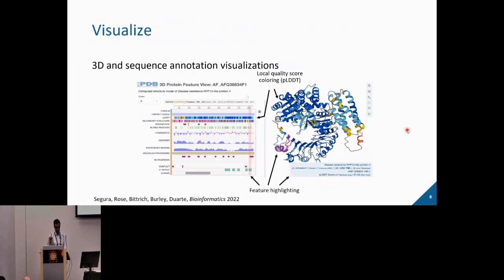And it's grown a lot, and it's still maintained by PDBe, by a larger community, and partially by us too. And on the left side, we have the sequence annotation viewer, which was created by Joan Segura at the UCSD site too. This is something we put together as part of our RCSB.org, but they are independent applications that can be used in your own programs if you have your own websites. So that's something that you can do too.